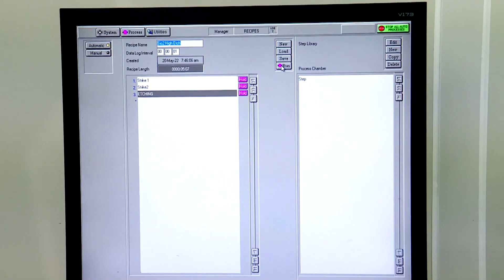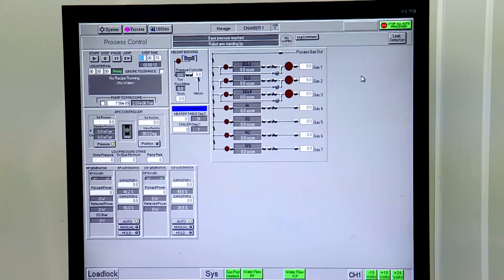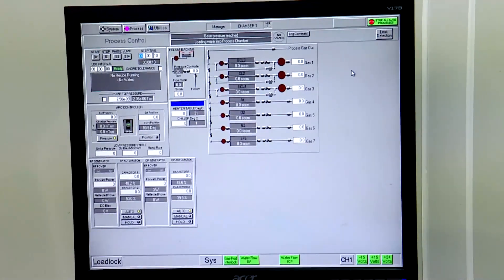We have to click the run button to start the recipe. Now, we see our chamber status.